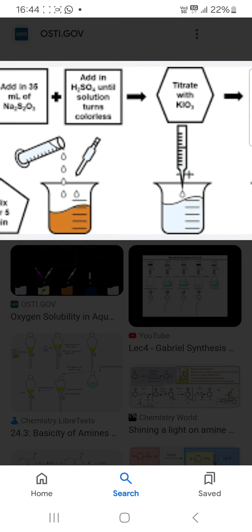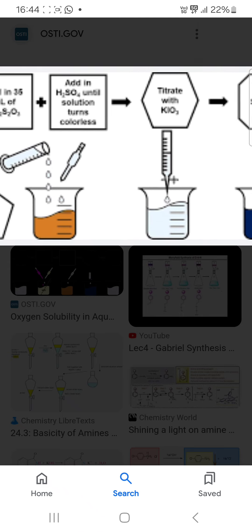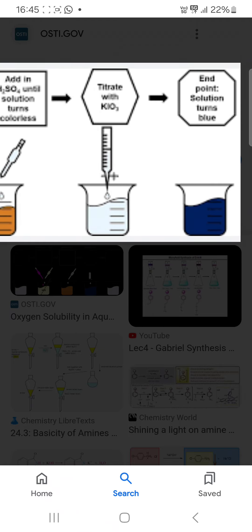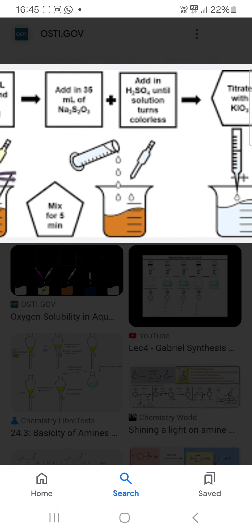Then titrate with potassium iodate. The endpoint is when the solution turns blue. So you can see the reaction steps.